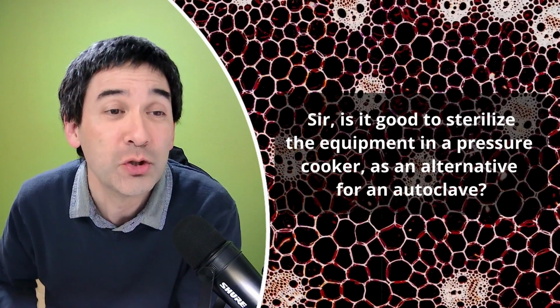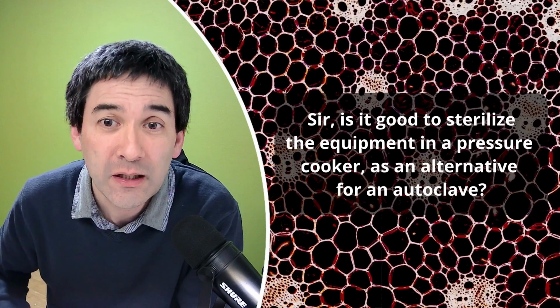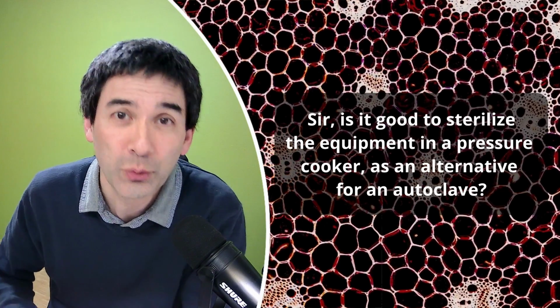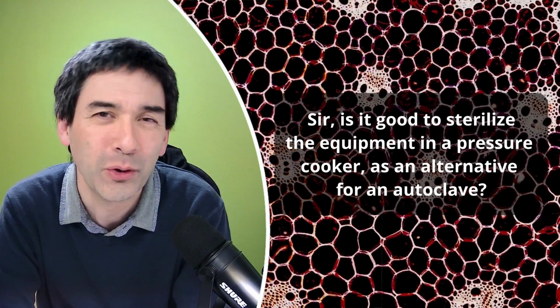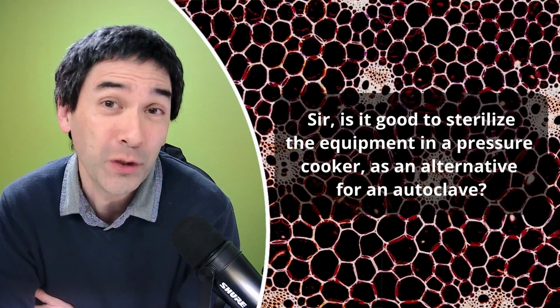Is it good to sterilize the equipment in a pressure cooker as an alternative for an autoclave? So what's going on here? Why even sterilize equipment, which equipment, and so on? And what are we even talking about here?